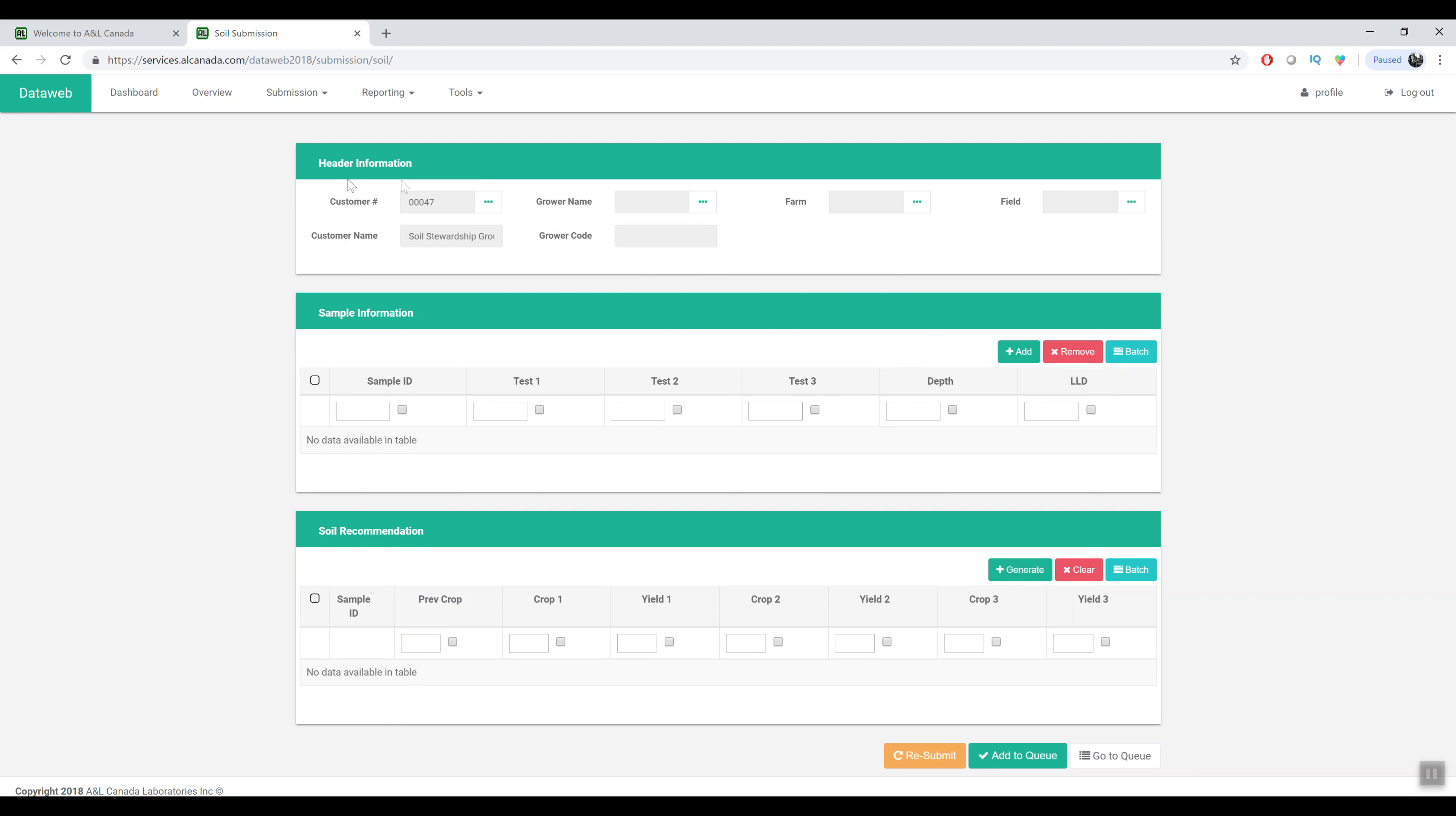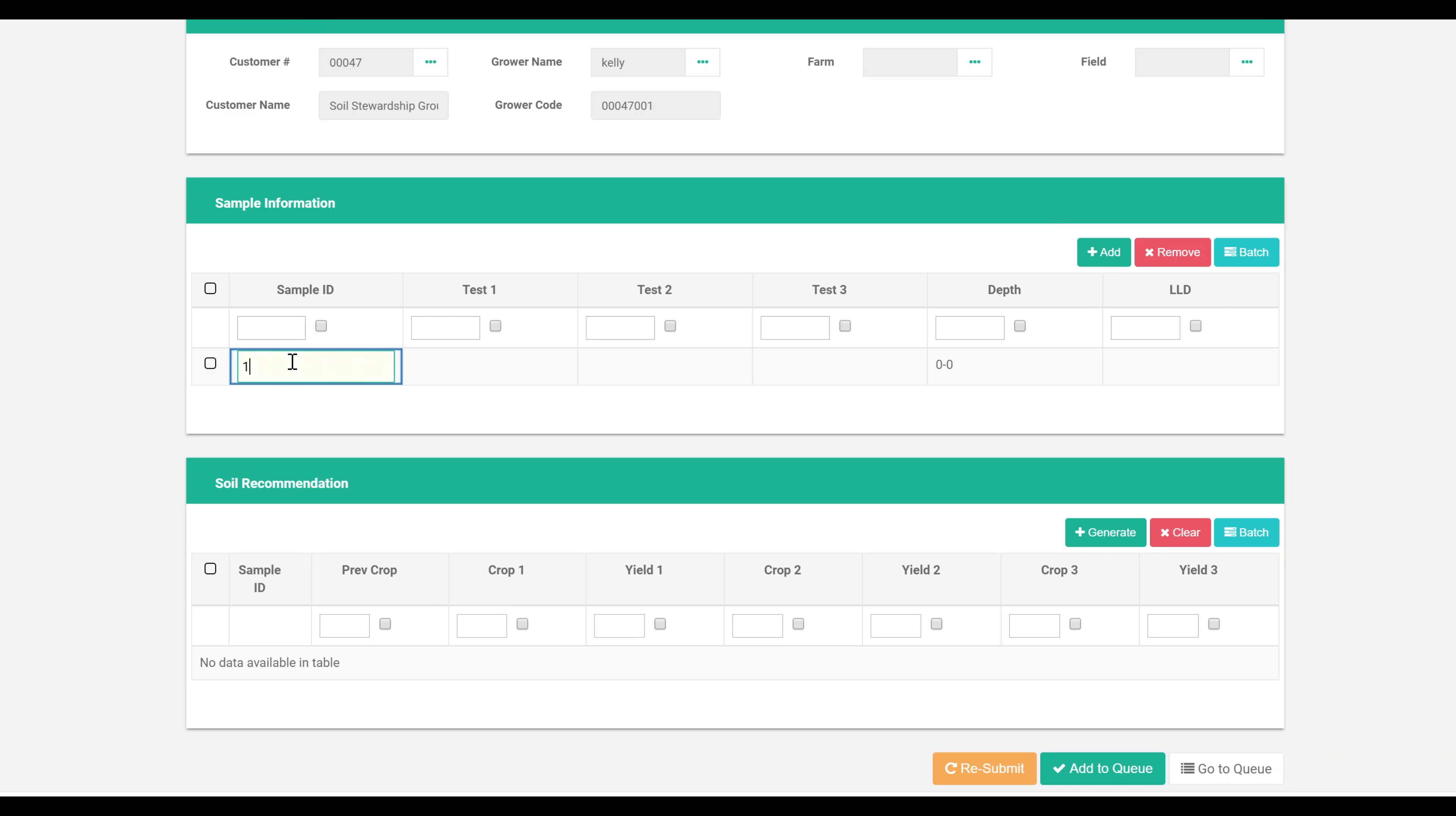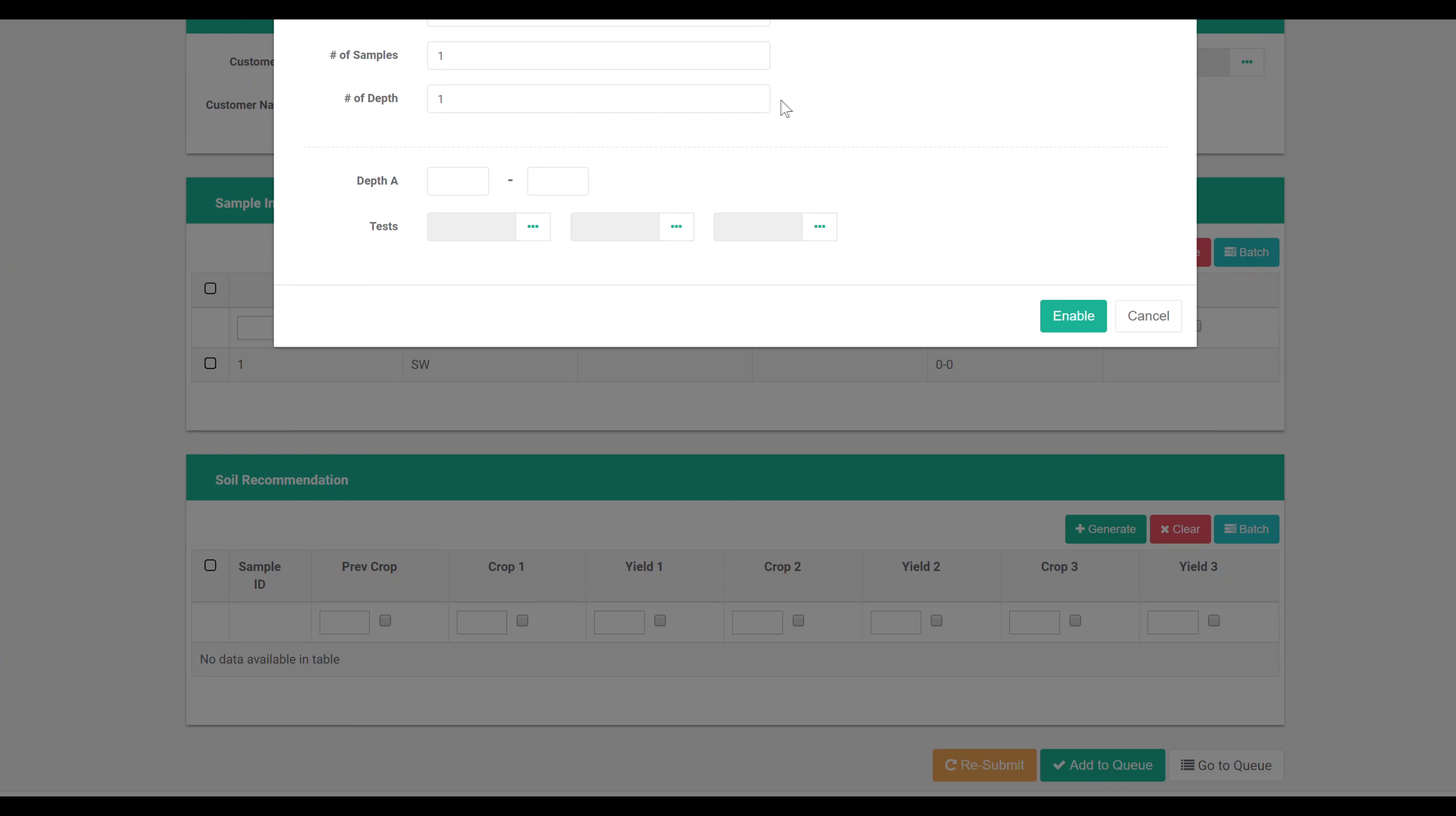For the submission area we've revamped this. Now instead of the wizard with one screen to the next, everything's on one screen. We can select the grower or create a grower, same with farm and field. We can manually create sample IDs and the test packages.